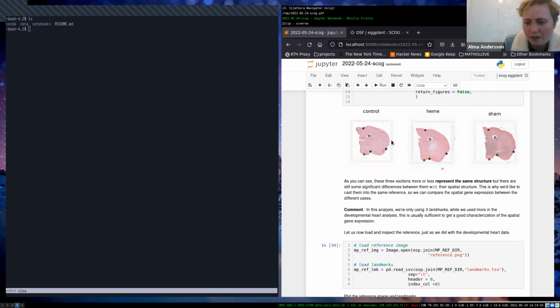Now, I haven't really worked with this kind of imaging data, so I can't make a super strong statement here, but I don't think it should be such a huge problem. You should probably be able to make the transfer. How you relate these two different modalities to each other, so imaging and expression data, would be a different question that I'm not really in a position to answer right now, given a bit of limited knowledge. But I don't think method-wise that should be an issue.